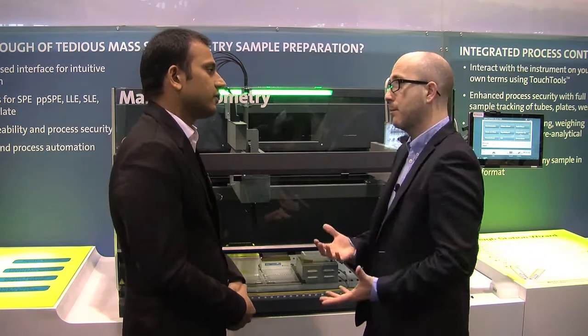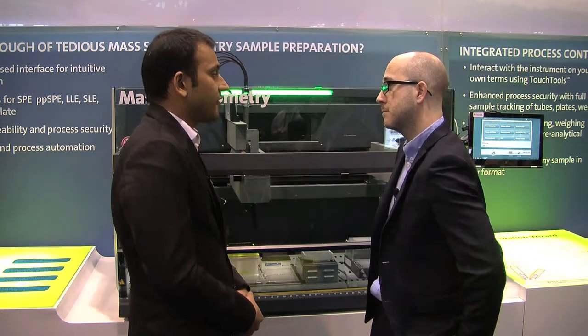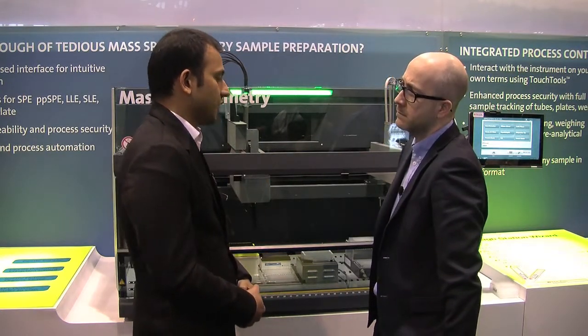We were talking just a little bit before and you were telling me some of the features of the software. I wonder if you could run through those for me, please. Yeah, sure. We've got an exciting software which is called Touch Tools. This is a great interface that allows users to run their applications with minimum training on liquid handling automation software. It's a simple click and run routine.